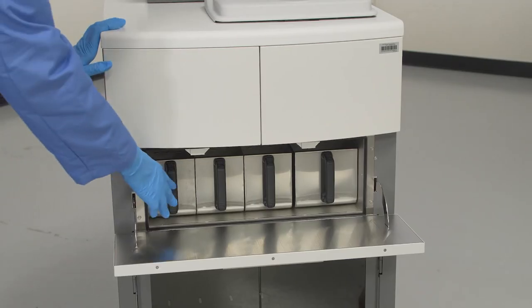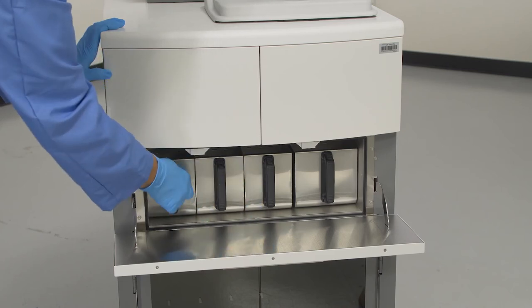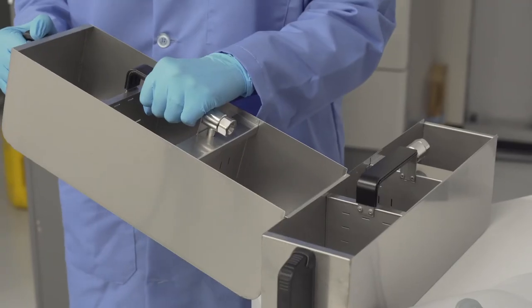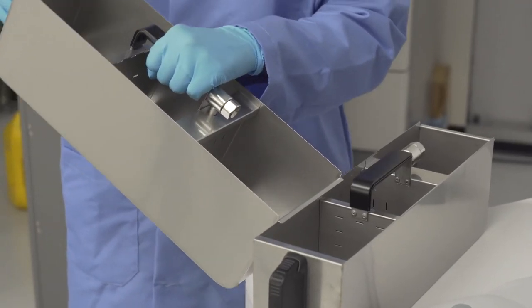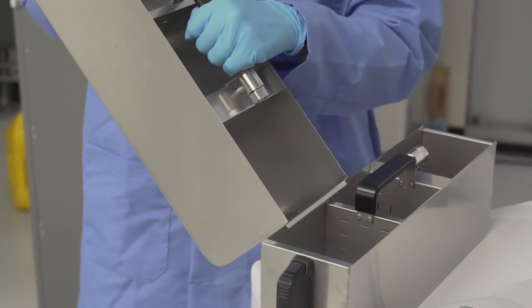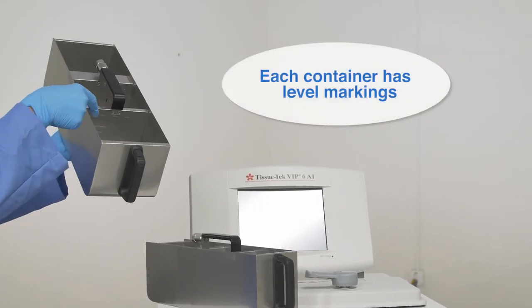Four paraffin containers are held in the oven: three small and one large. Each container has a lift that can be used to position one container on another to easily transfer paraffin. Also, each container contains a baffle with level markings.